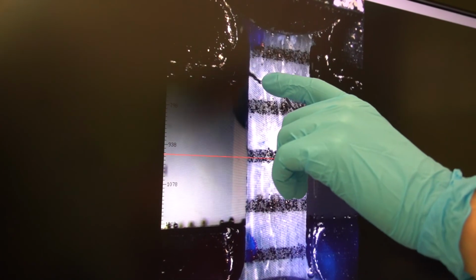Then we unload again, and when we do this now the third time, we see that first here a crack starts, but then very rapidly you see that it fractures actually here on the top, but localized in 2 regions, whereas here we have almost no deformation or very small deformation. Let's have a closer look at the results after data evaluation.